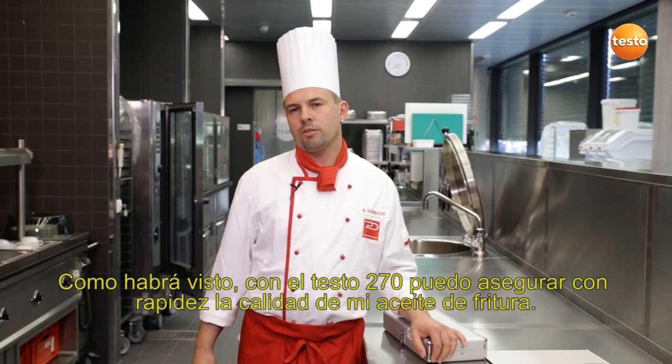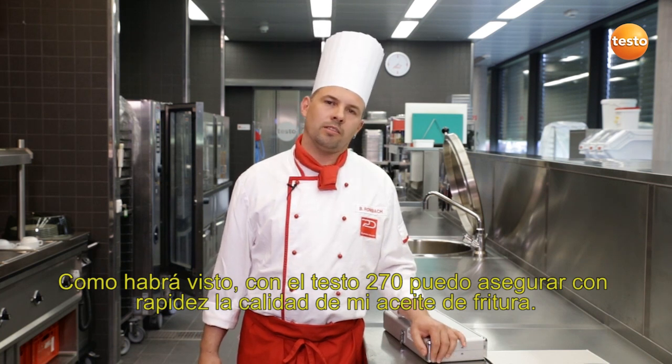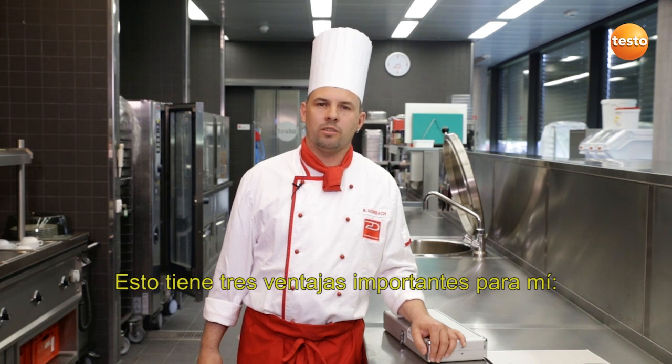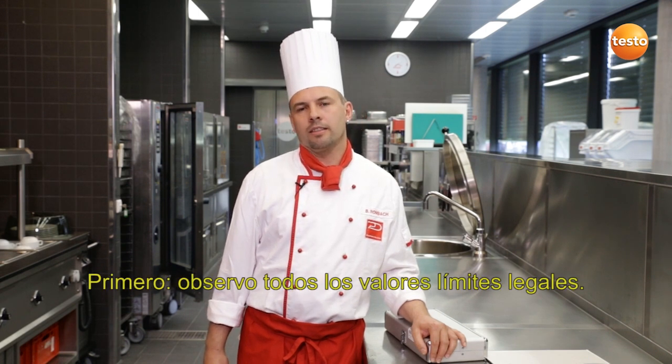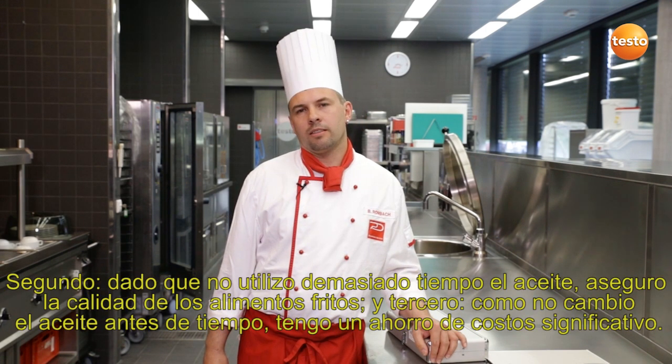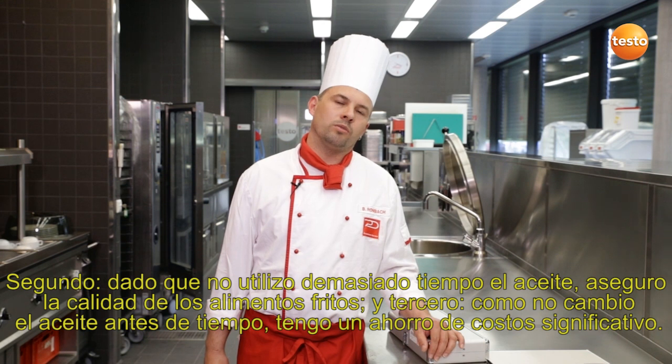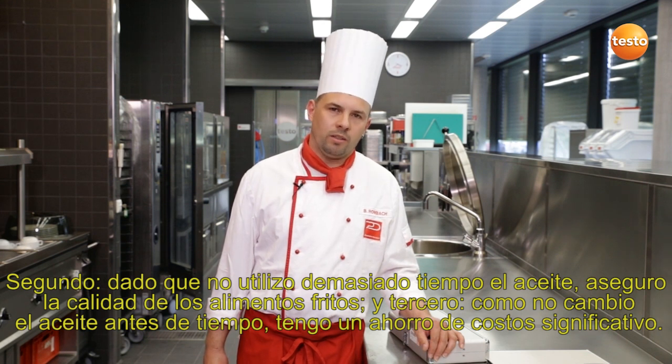As you can see, I can ensure the quality of my cooking oil very quickly with the Testo 270. For me, this has three significant advantages. Firstly, I comply with legal requirements. Secondly, since I don't use the oil too long, I ensure the quality of the deep-fried foods. And thirdly, as I don't replace the oil too early, I can considerably save costs.